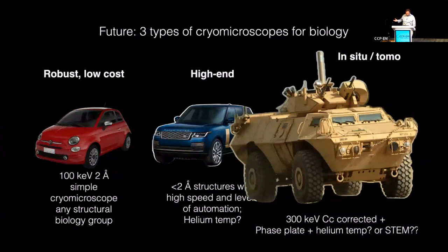And it could be that STEM could be involved here because it's not subject to the same chromatic aberration that we're limited by in TEM. However, it's got lots of problems of its own. And Karsten's going to talk about their efforts there, who's probably gone the furthest on this so far. But what exactly this instrument looks like, I'm sure it will not look like what we're buying today in 10 years' time. But exactly what it looks like, we're still going to have to find out.